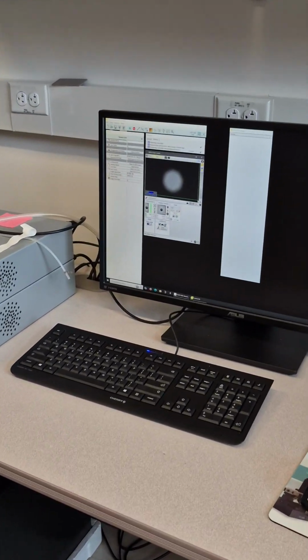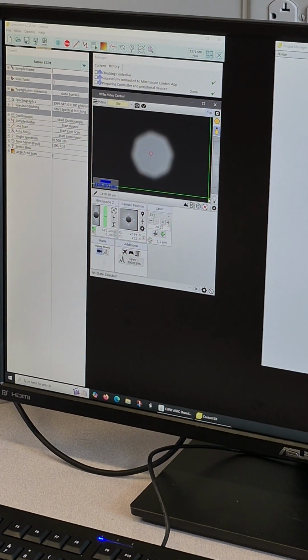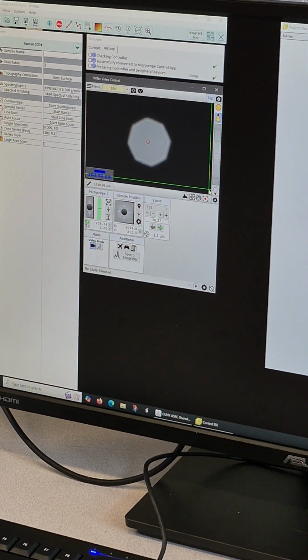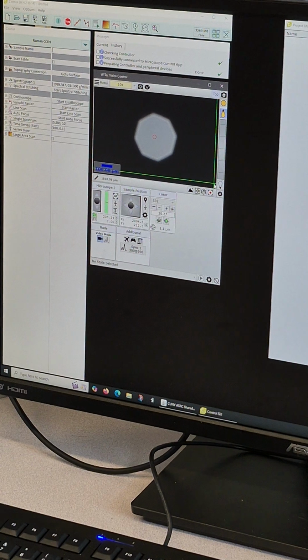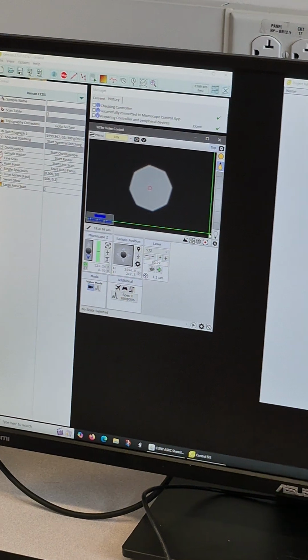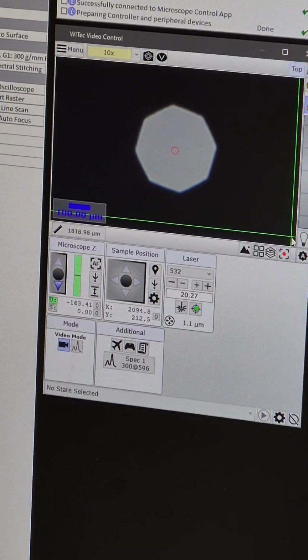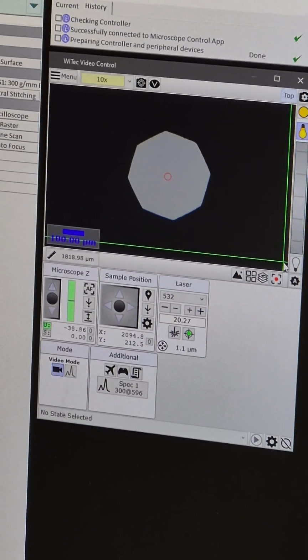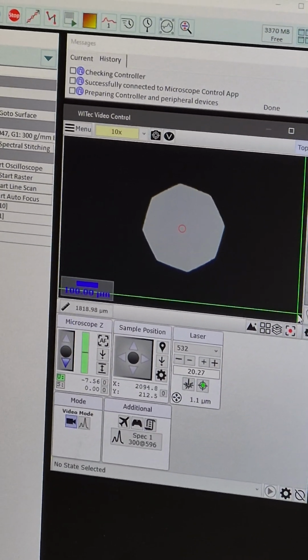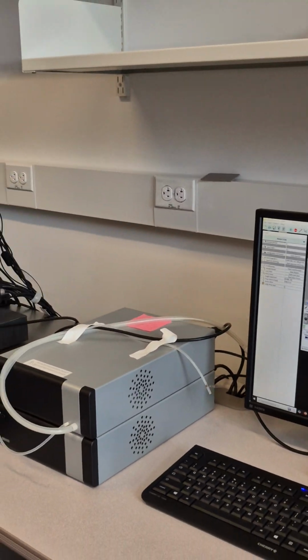So you just move down for 1 or 2 seconds, and move down, and the edge gets even sharper. So that's good. Move down and move down, and once you see roughly that the shape is very clear, although the edge is still blurry, you don't do the continuous anymore. You just do this one. Let's see, sharp, sharp, sharp. If I continue to move down, it starts to become blurry. Then I should move up. So this is the way you focus on the sample. You just move up and down until you see a sharp edge. And once you see that, you just remove it.